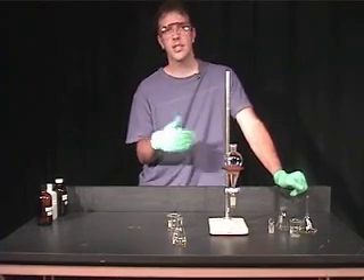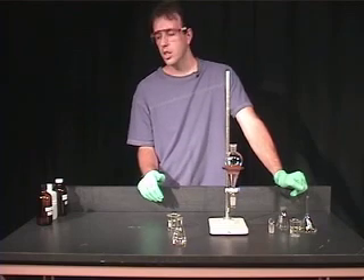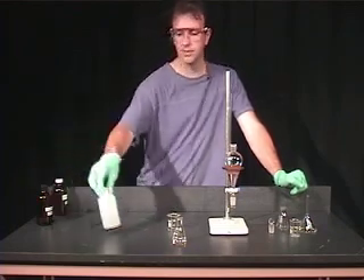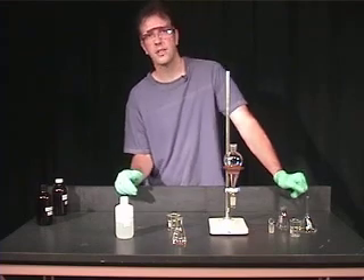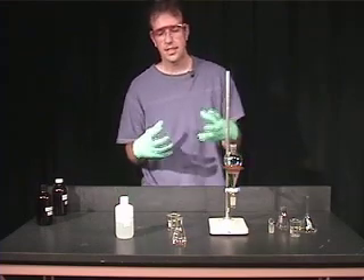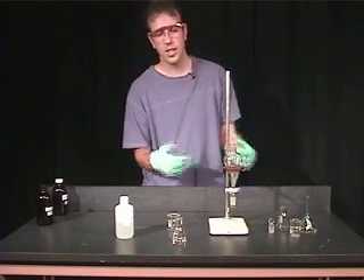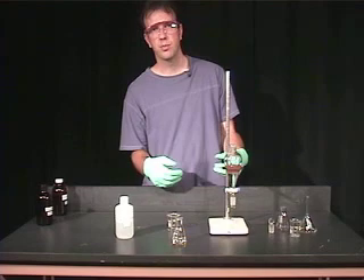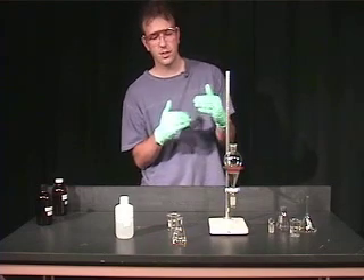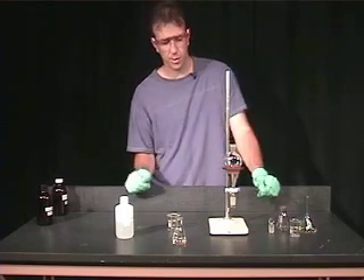In the case that you get a more serious emulsion, there are several ways to approach it. You can add a small volume of saturated sodium chloride to the aqueous layer. It dissolves in the aqueous layer and makes that solvent more polar, so the difference in polarity between the two solvents is larger, causing the two layers to separate.